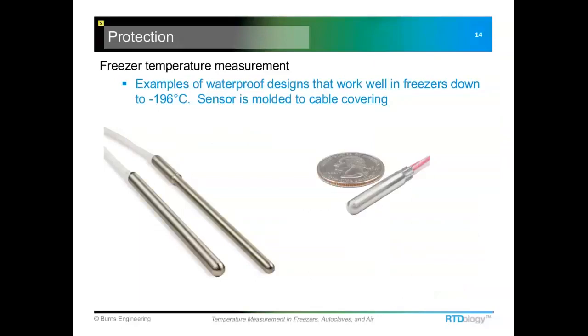Some of the waterproof designs, they'll look pretty much just like any old RTD probe. These examples here are ones that are actually molded in, I think it's FEP or Teflon.